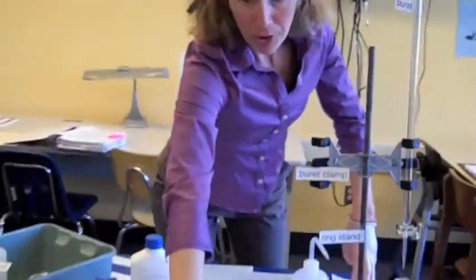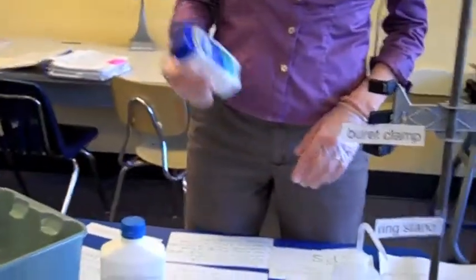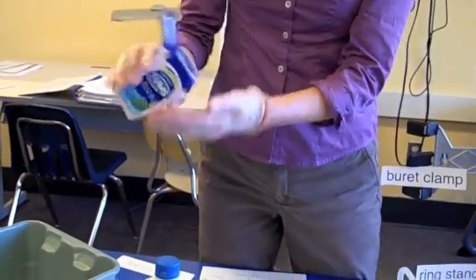This is the lab you're going to be looking at when you do this. Step 1 is set up the titration apparatus. This is it. Step 2, obtain an antacid tablet and record its name. I'm going to grab one of the three options. It's called Tums. And I'm going to write its name right below here, antacid, Tums.